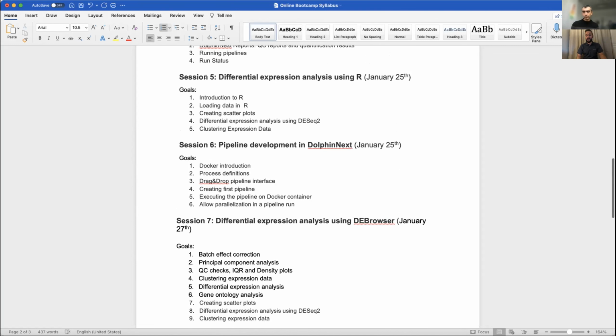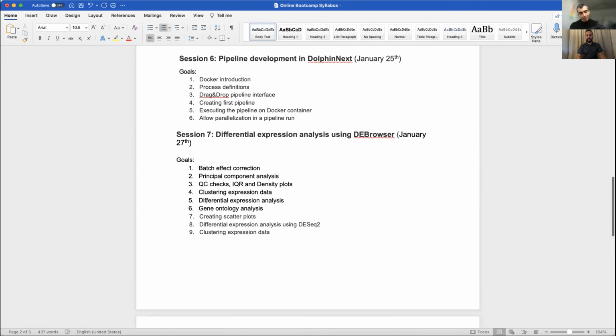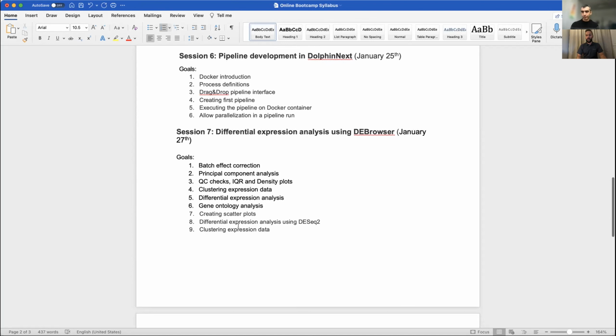I'll tell you later, if you install R and RStudio on your computer, you can move faster. But there are other ways that I will show you when we start learning R. We have R in our cluster, so you can connect and use RStudio in our cluster. I'll show those kind of things later. And then I'll show you the easy way of doing some differential expression analysis using the browser. This is also an interface that you can do many things with without writing a single line of code.